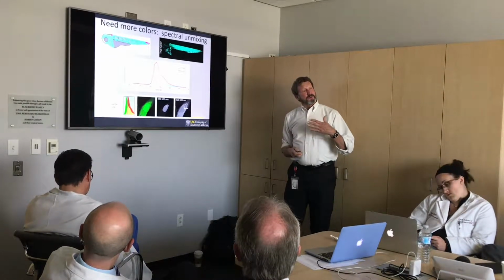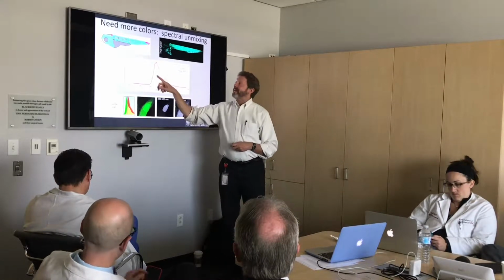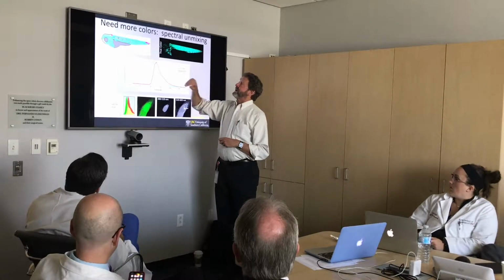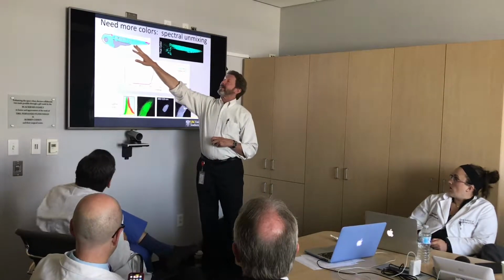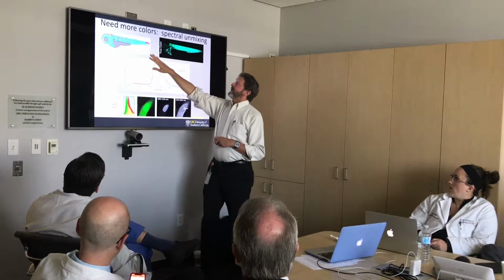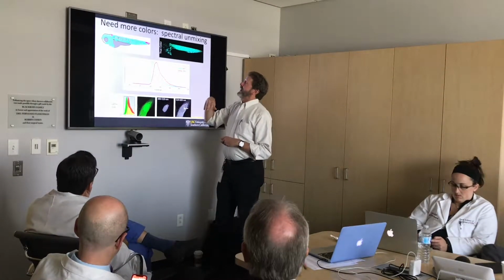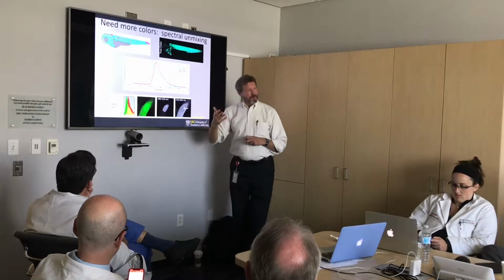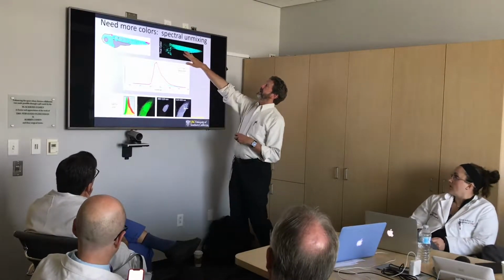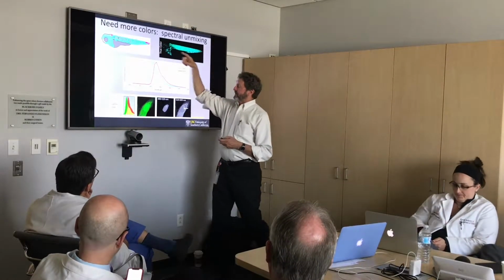So the good news is we can label it. The bad news is we label it with dyes, and the dyes always overlap one another. And so if we take a transgenic animal that we work on in the lab a lot, watching the vasculature form, if we put a GFP variant in the blood vessels and a YFP, a yellow fluorescent protein variant, being expressed in all the muscle cells, and you looked at it by eye, it would not be very striking, not as striking as a cartoon.